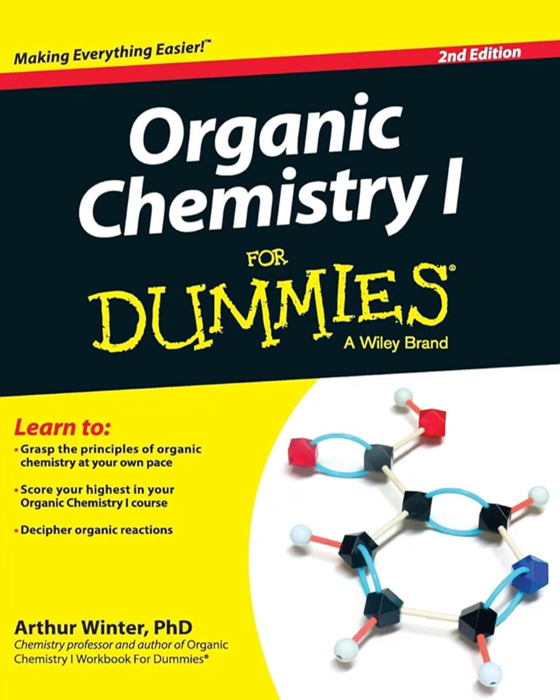So if you see CH signals above that 3,000 centimeter dividing line, it tells you immediately you have CH bonds on an sp2 carbon. That means you almost certainly have double bonds or an aromatic ring present. It's a key diagnostic feature. Okay, that's super useful. Above 3,000 for alkene and aromatic CH, below for alkane CH. Got it. Exactly. All right, let's shift our gaze now.